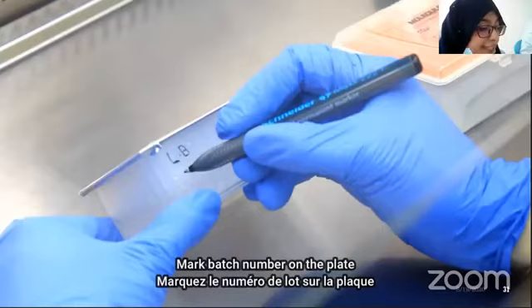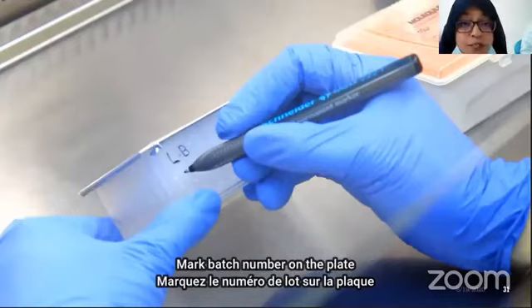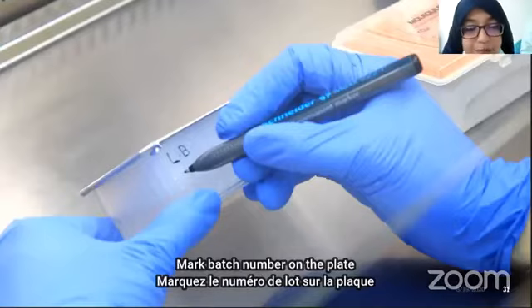For positive and negative controls, is the same sample added into two wells, or are positive and negative samples added in the same well? No, positive and negative samples are added in separate wells, because a positive sample carries the viral RNA.